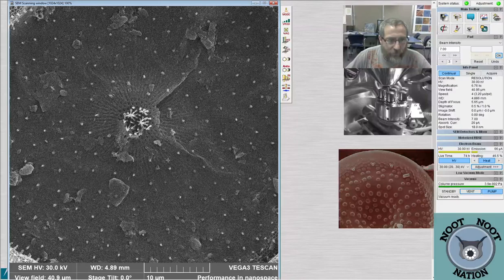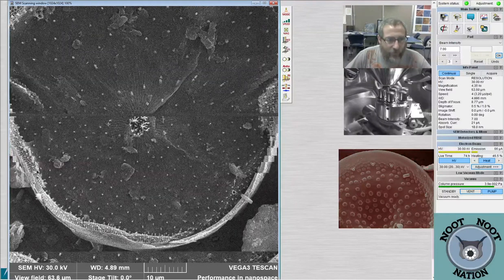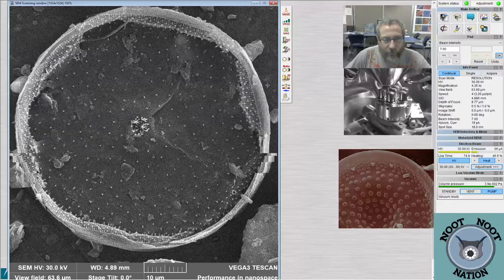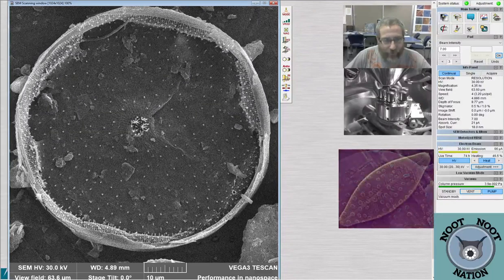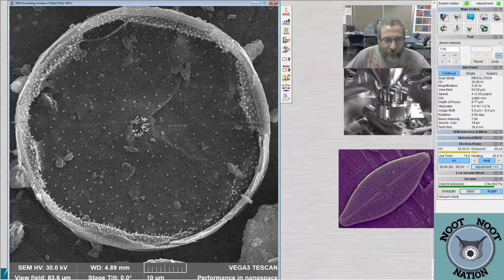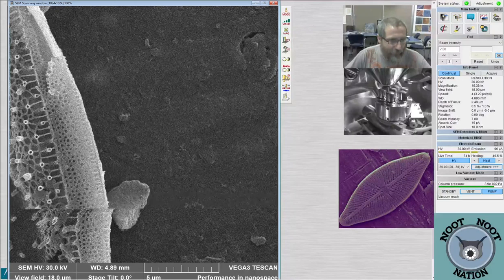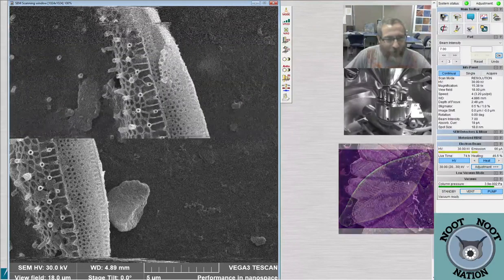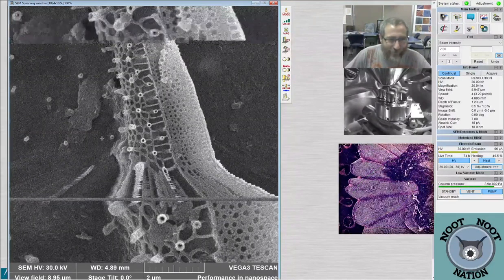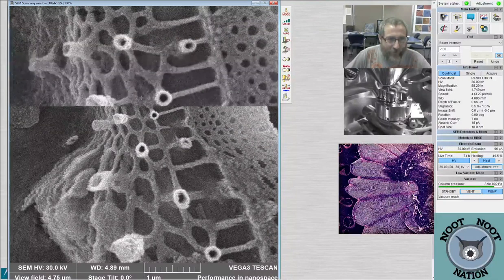And that's the inside, though. This is an inside view, yeah. And when you get to the... So this is also very lightly silicified, so that's why it looks like it's collapsed on itself, because it has. But one thing that's nice about that is it actually lets us look at these a little bit more closely. So these are the mantle fultoportulae. I went a little overcompensated there. This is the mantle fultoportula on the sides of the Thalassiosira.